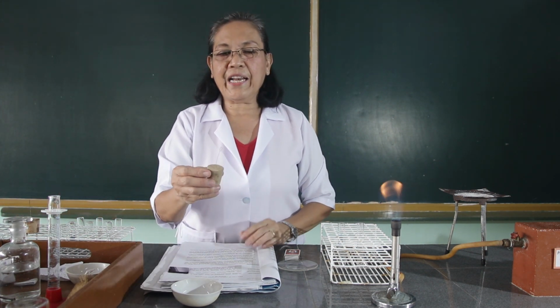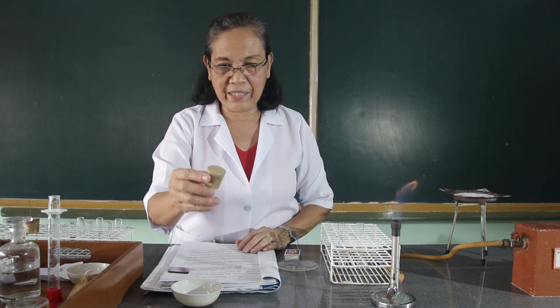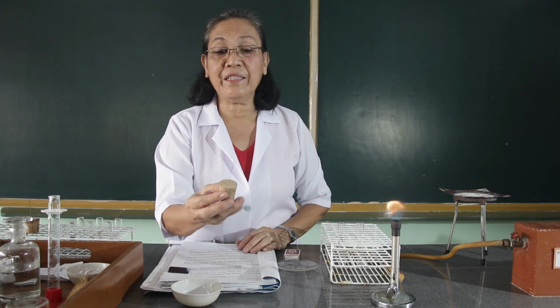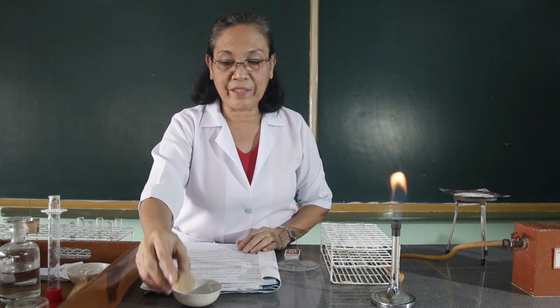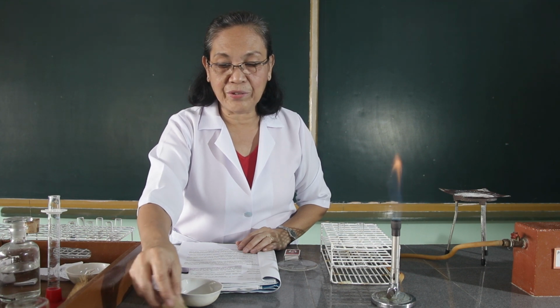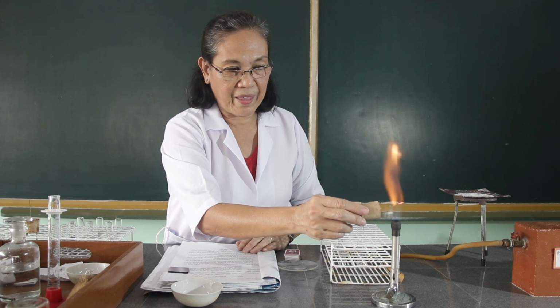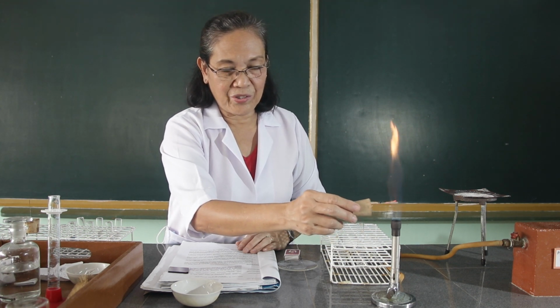And again, we're going to clean the nichrome wire before we use it for the flame test, because it has been contaminated by the potassium ion. Dip it again in the hydrochloric acid solution, then bring it to the flame. Okay, there's still the potassium.